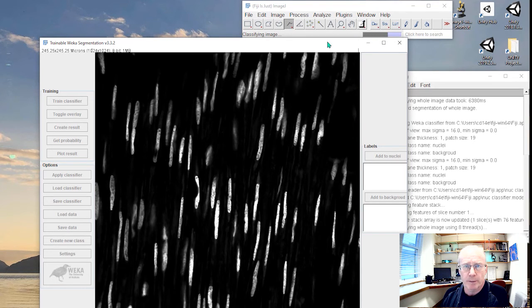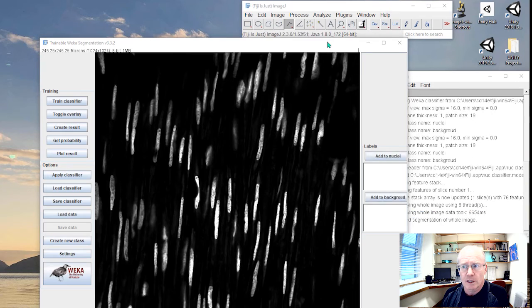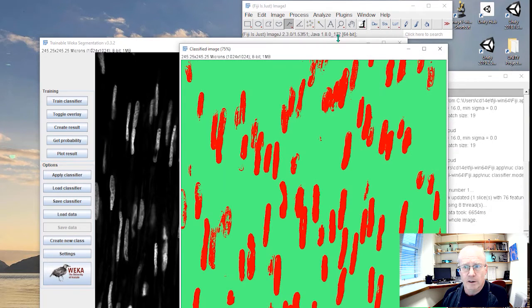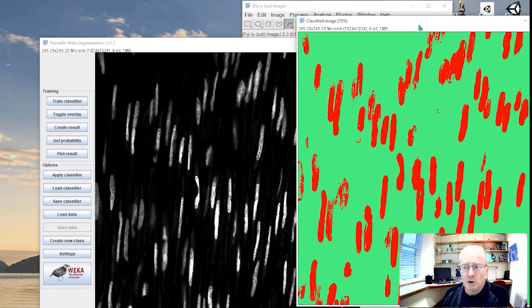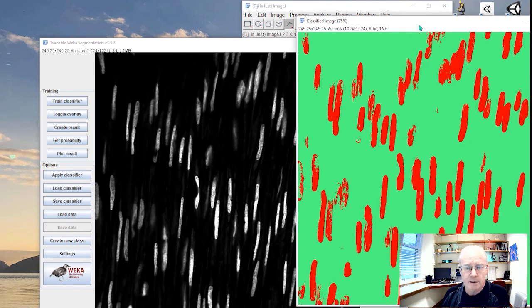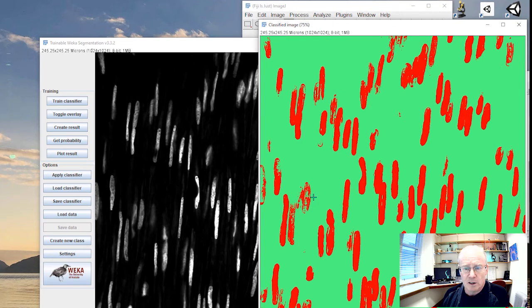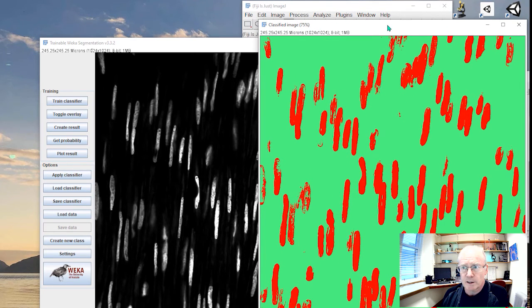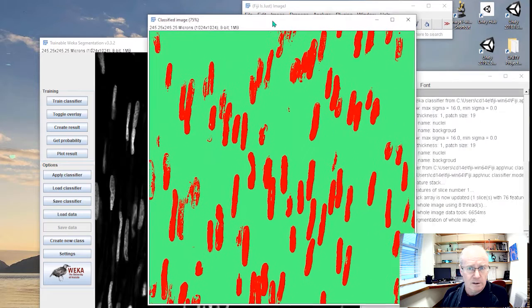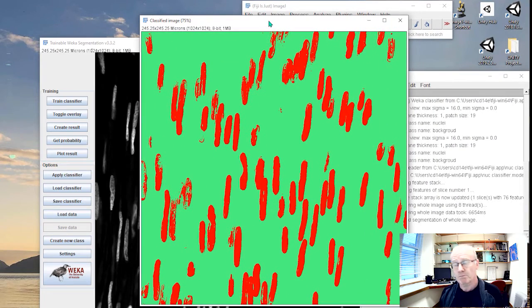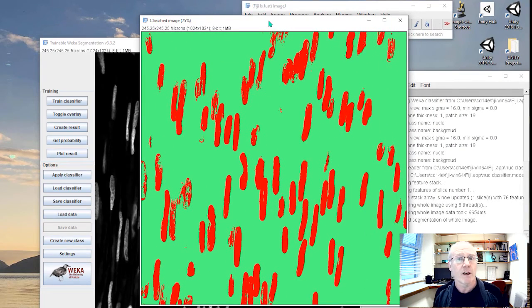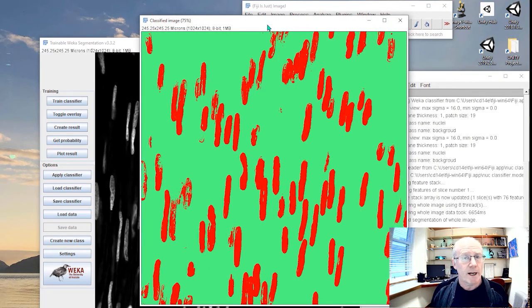And watch up here for progress. I won't speed up any of this video. So we'll give you an idea of the speed. There you go. Not too bad. You can see it's fused these two together, but anyway, not too bad.